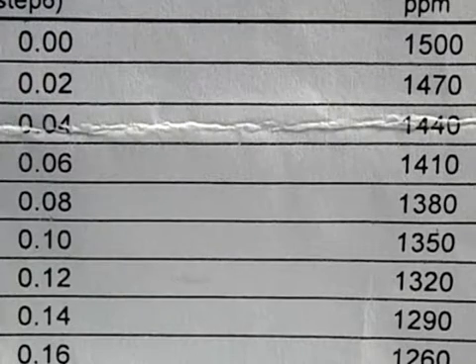The final step is to take the number you ended up with — which we got point zero eight — and find it on the chart, then go over to the right. That tells you your magnesium level, which mine is at one thousand three hundred and eighty parts per million.